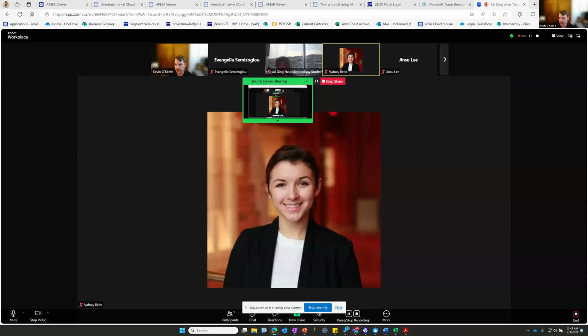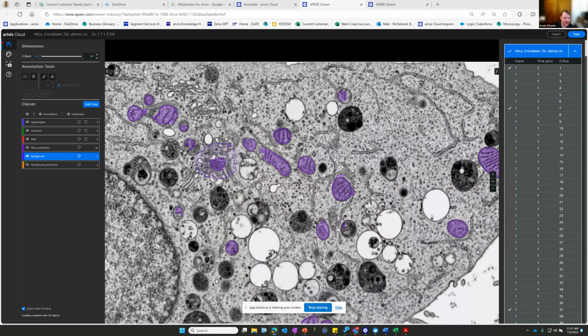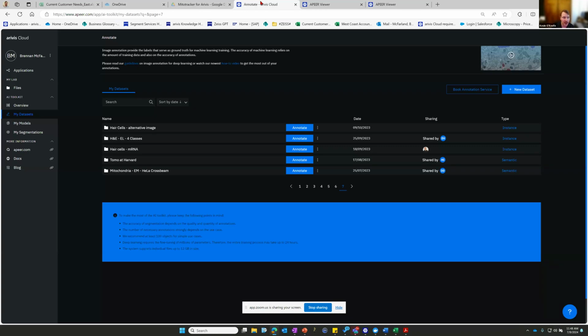I'm going to go over Arivis Cloud now. I think it's not super hard, but it's pretty basic in terms of what it's meant to do. Let me close off some of these things here.